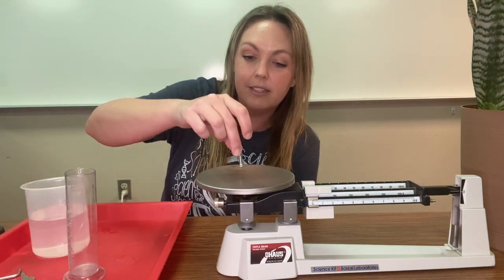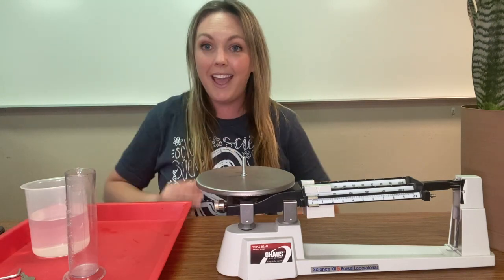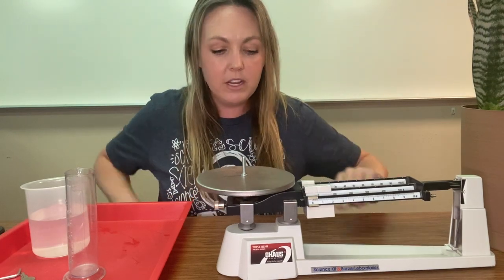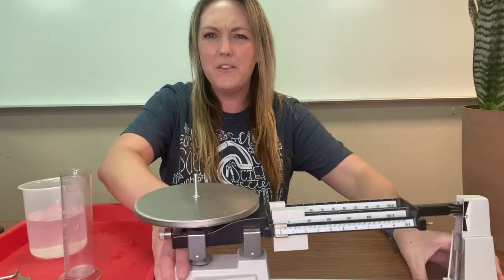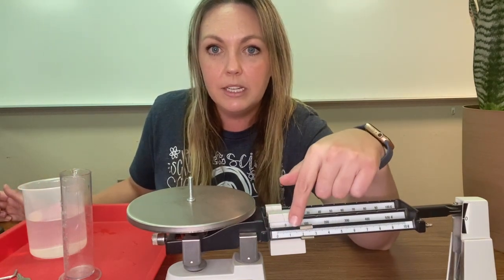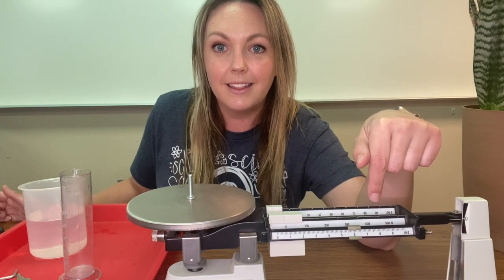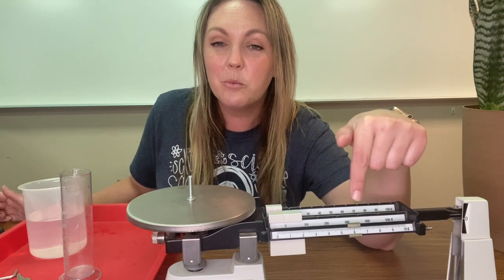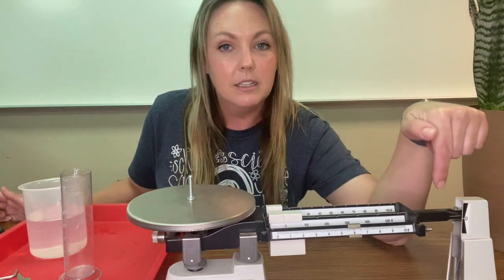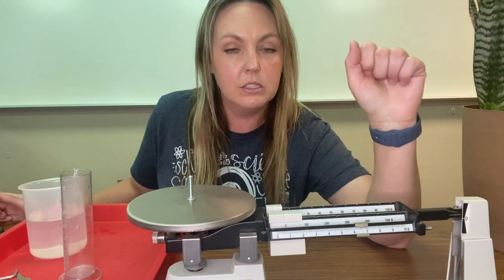So I'm going to set this in the center of the triple beam balance and you will notice a change. This is heavier than zero grams. So you want to start on this very bottom one — I'll move this up very close — and we want to move this until we notice a change. Still a little bit heavier, the screw is a little bit heavier, so we're going to keep going just a little bit.